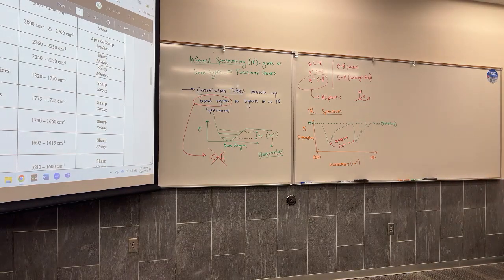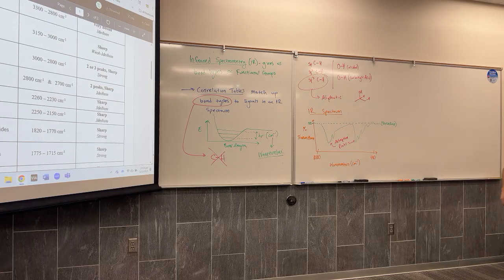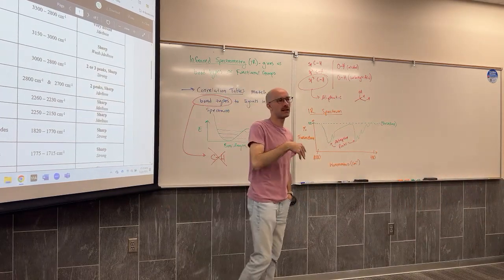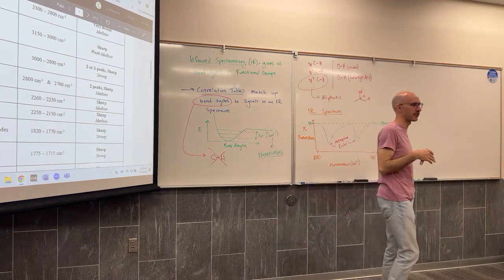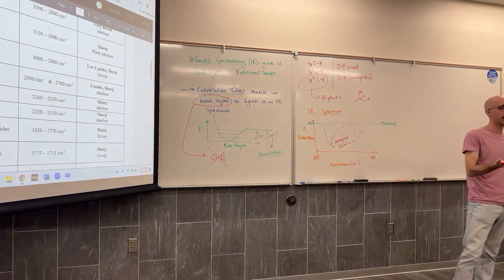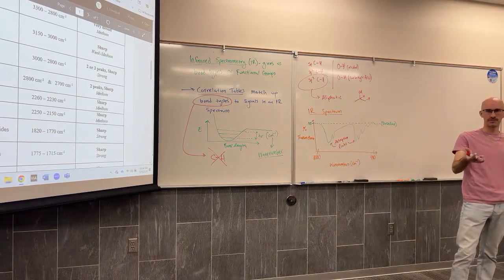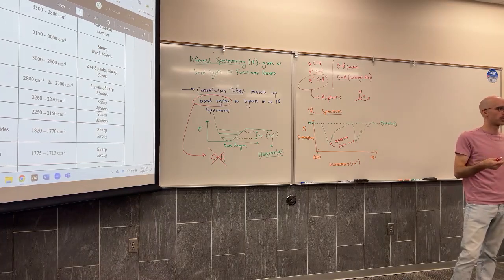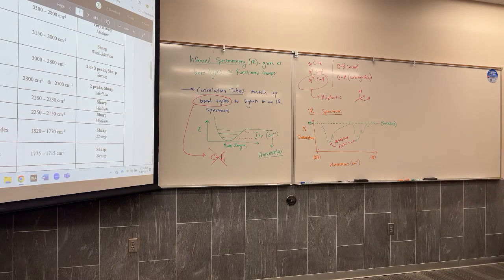Methane, sp3 CH. Methane absorbs incredibly well. There's not a lot of methane down here at surface level, but we are breathing a lot of water, and we're breathing a lot of CO2, and so there is a lot of absorption from those two things next to your spectrometer. Oxygen, O2, does not absorb in the IR. Nitrogen, N2, does not absorb in the IR.